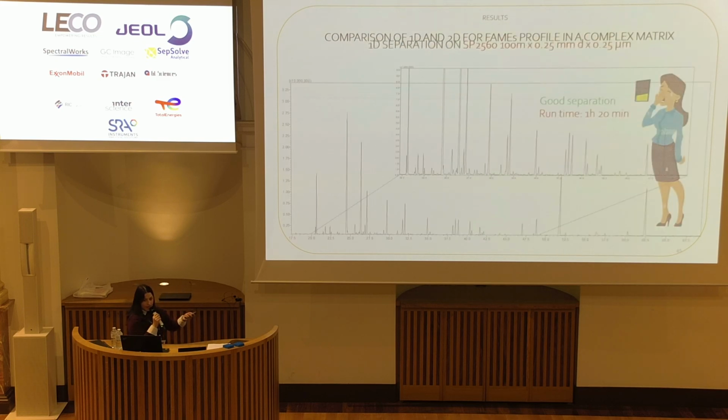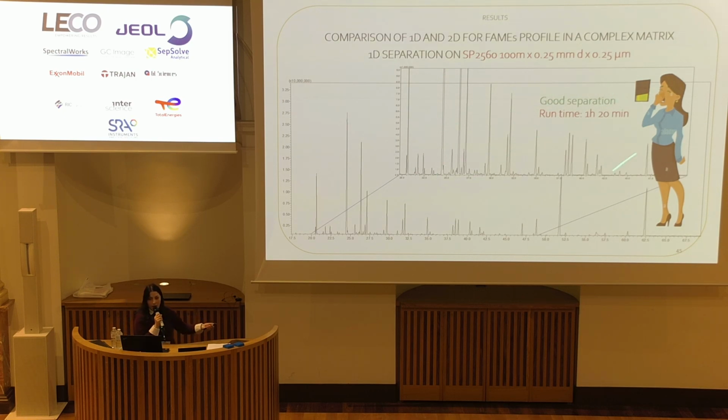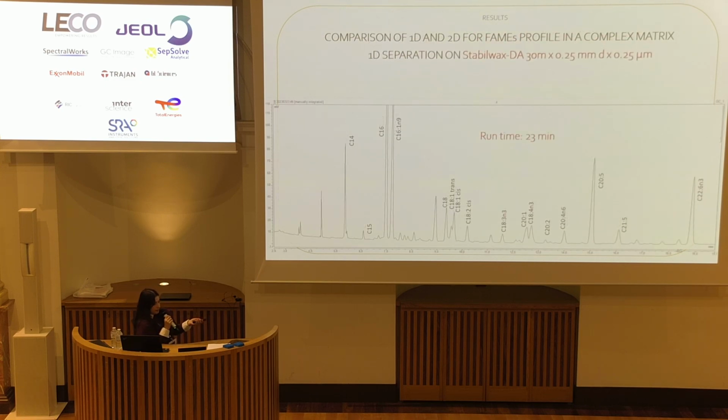And I say, yes, but you have to use a column like this, okay, you can have good separation, but the runtime is 1 hour and 20. That is not convenient, for example, for a routine lab that needs to process a lot of samples in a short time. So let's take a column that is widely used for this analysis.